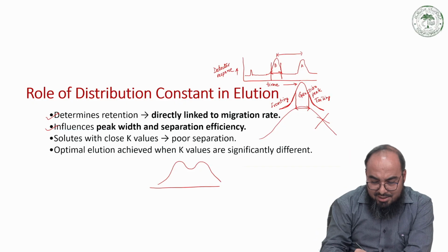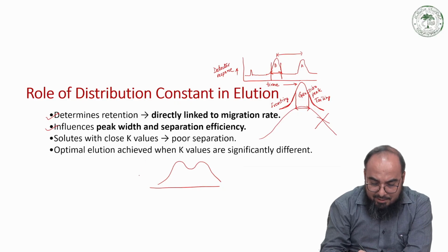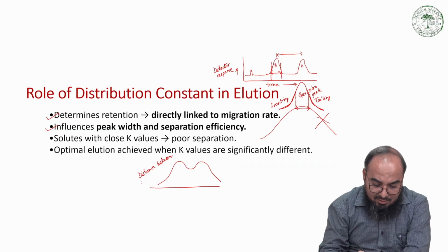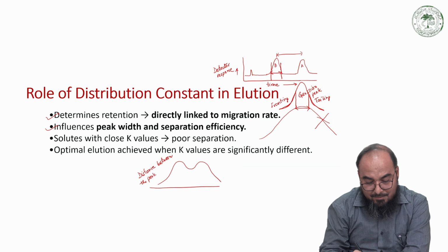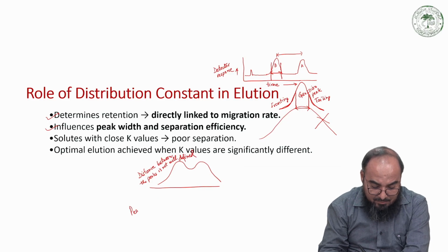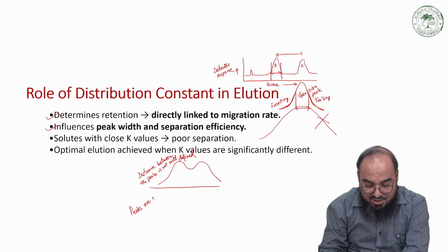And here you can say that the distance between the peaks is not well defined, or you can say peaks are not separated.